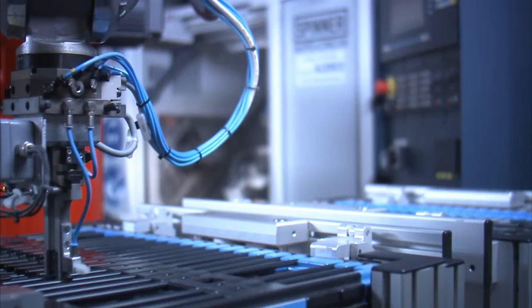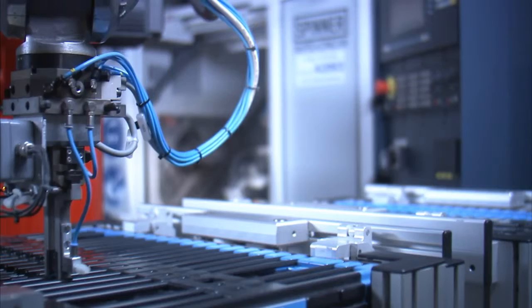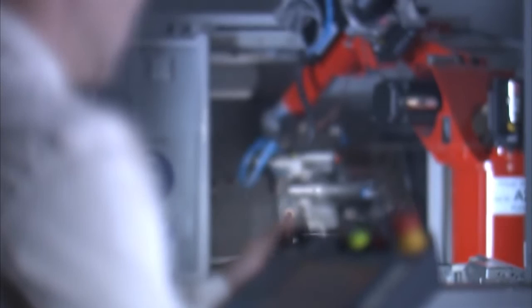The most modern high-precision robotic manufacturing ensures process stability and very high reproducibility of monolithic column products in many variations. The robot can handle columns and guard columns of various inner diameters and lengths.